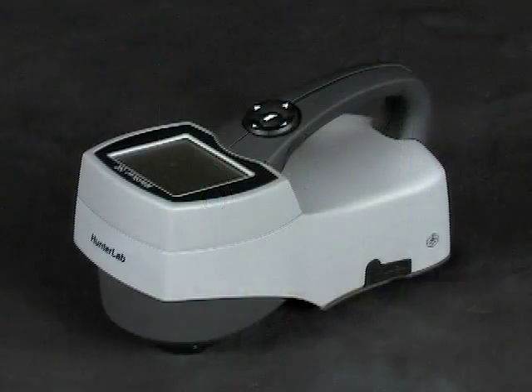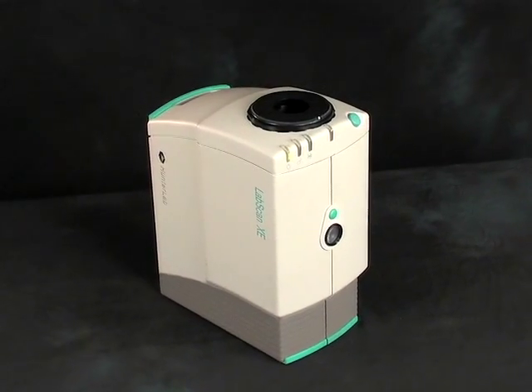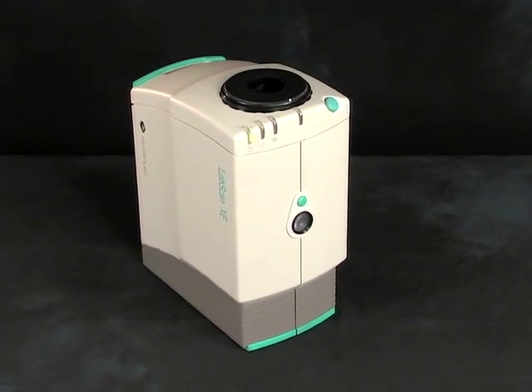HunterLab systems include benchtop, portable, and online instruments. In this measurement demonstration, the LabScan XE determines the color of opaque plastic pellets.